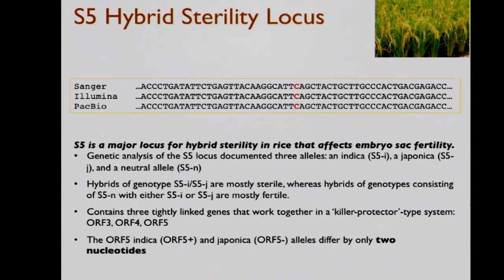So that's the PacBio, exactly matches the Illumina. We also did Sanger sequencing because it was so important, and it exactly matched. So at the base pair level, again, this is all built out of reads that have about 15% error. In this region, we had 100% accuracy compared to our Sanger validation and our Illumina validation. It was a perfect representation here. So this is just, I don't know, 100 bases or so.